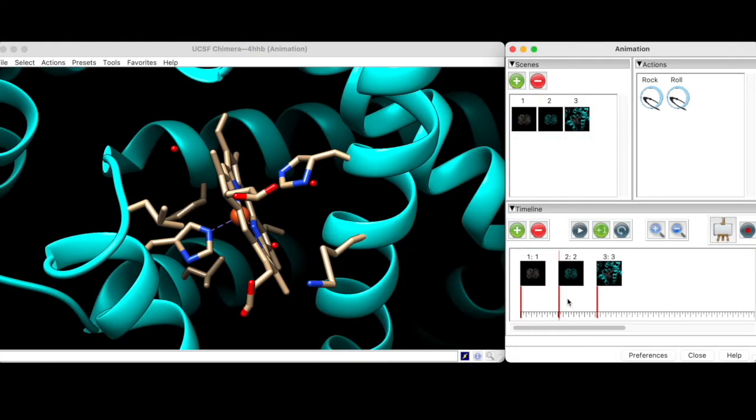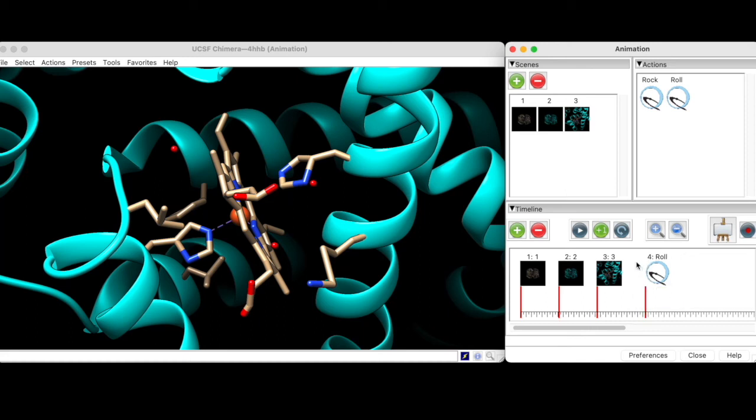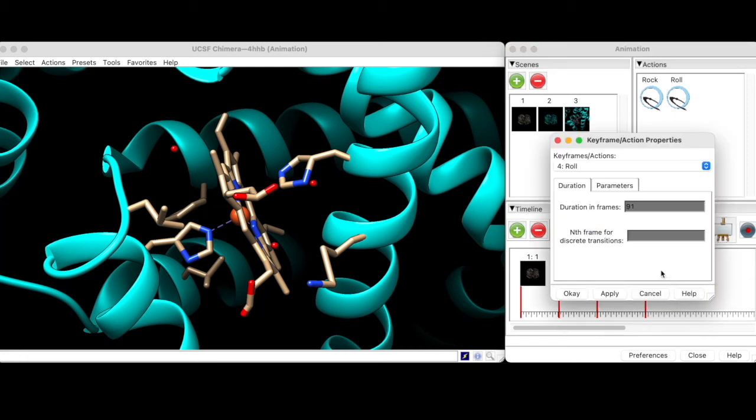Finally, we can add a 360 degree rotation to the animation by dragging the Roll action into the timeline. We don't want the rotation to be too fast though, so we will allow 7 seconds by going to Properties and setting the frame number to 168.